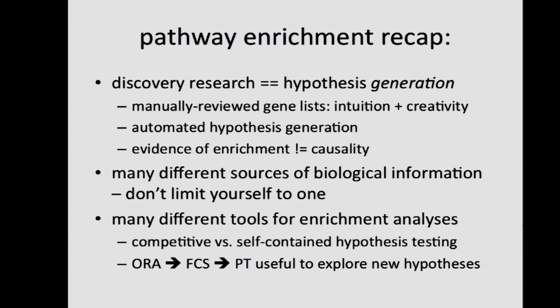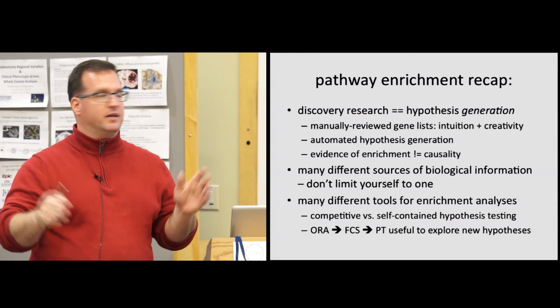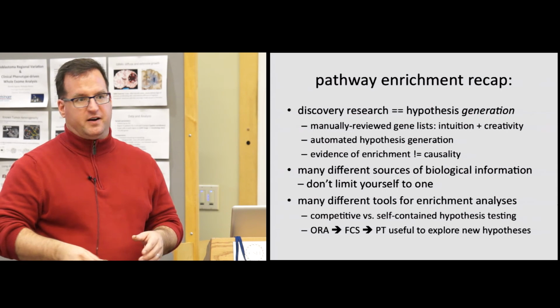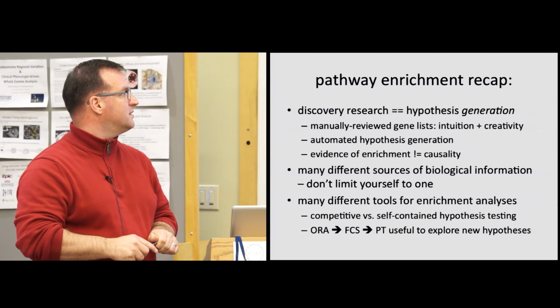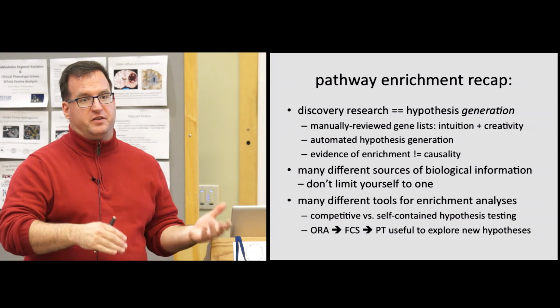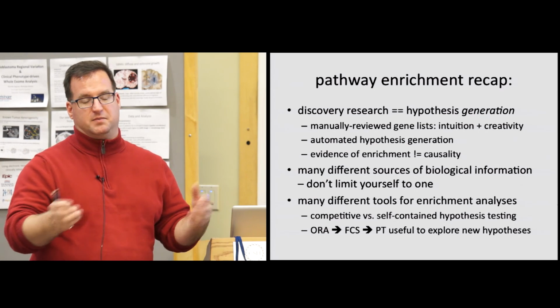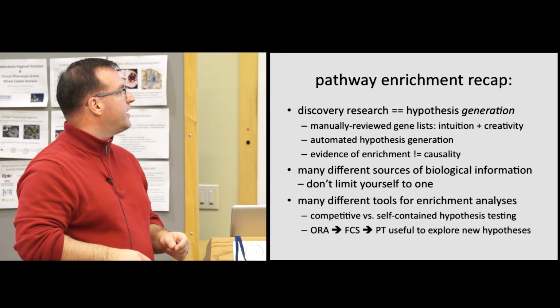Many, many different sources of biological information. Here's where you can use your intuition and creativity. Don't say, I'm going to go to Gorilla because Aaron Mackey told me to, and I put my gene set in and I didn't find anything, so now I'm done. There's so many resources out there. We've touched on some of them. Lisa's going to talk about some more of them. This is where you can actually really have fun with your data because it's more about the biology and less about which command line flag do I need to get this or that.